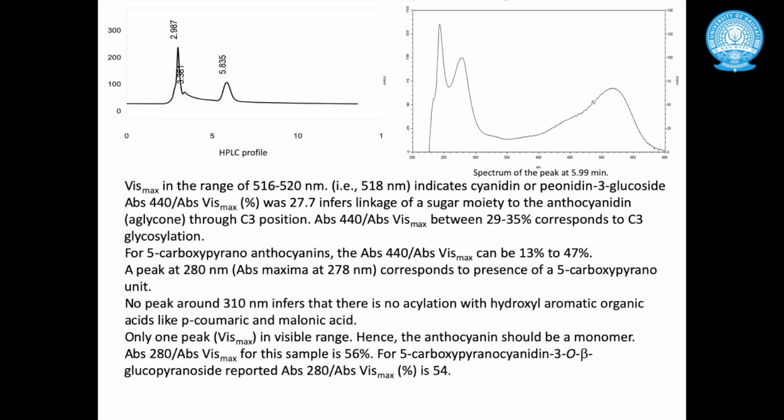When we study the spectrum of this particular 5.835 minutes retention time peak, on the right top panel what you see is the spectrum of this particular peak.